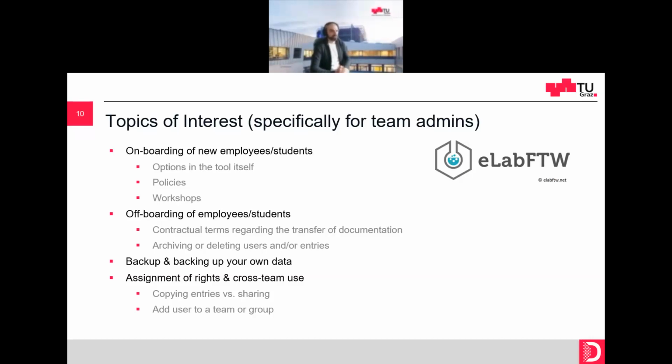This is not always clear, but again, our team and we are here also to answer these questions if you have them. If you start with them and you're not sure, or you need something, always reach out to us.